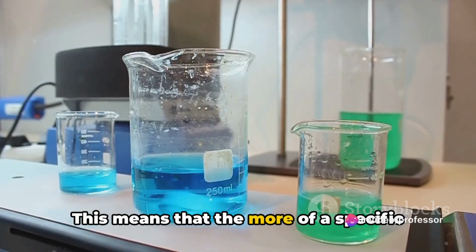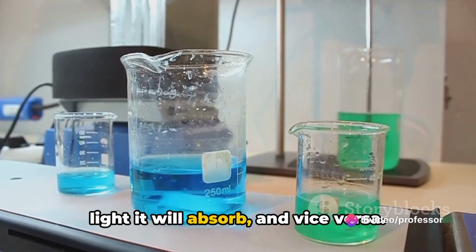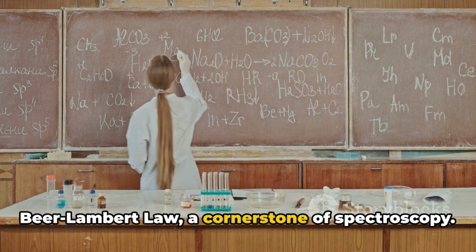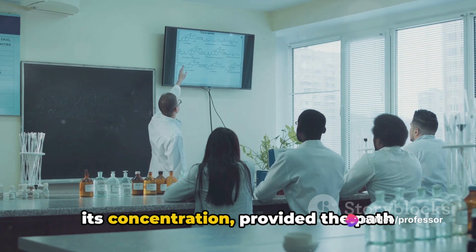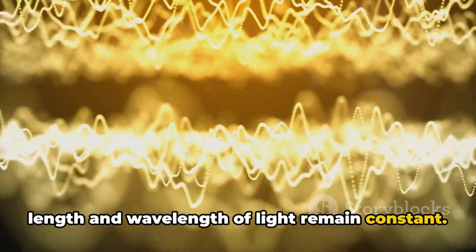This means that the more of a specific element you have in your sample, the more light it will absorb, and vice versa. This relationship is governed by the Beer-Lambert law, a cornerstone of spectroscopy. It states that the absorbance of light by a substance is directly proportional to its concentration, provided the path length and wavelength of light remain constant.